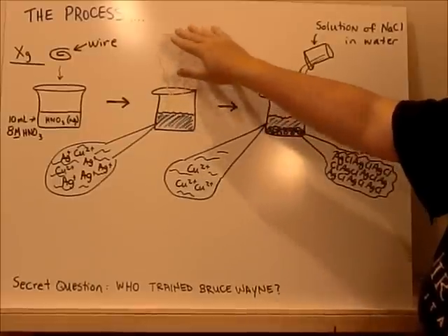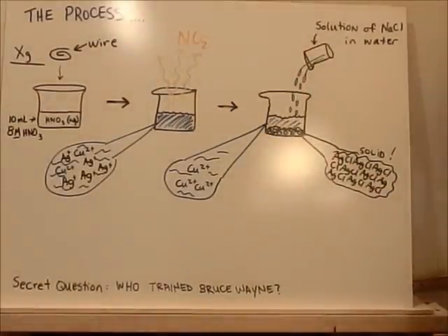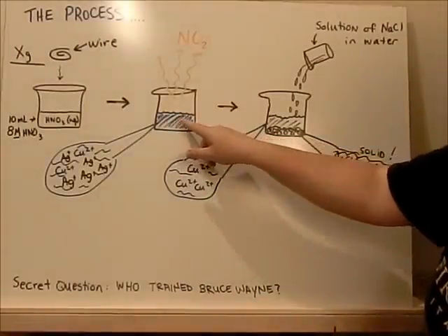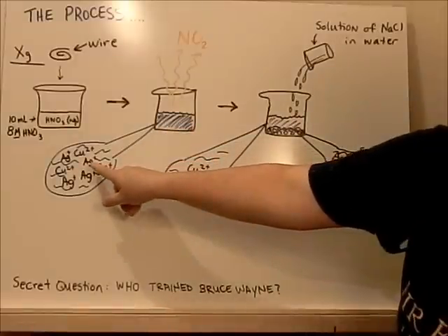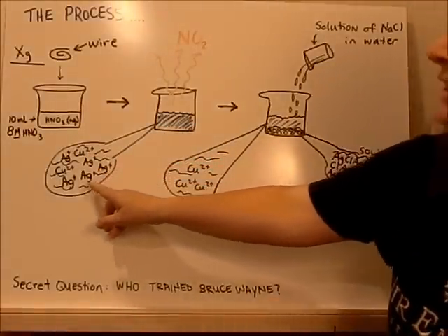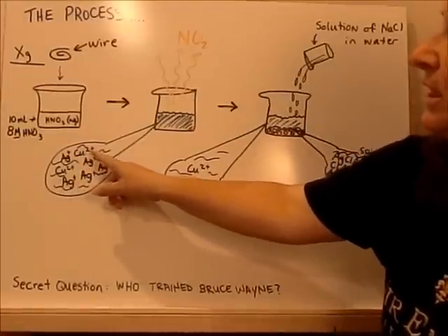You'll see a nasty gas comes off that's a mixture of NO2 that turns into N2O4. And if we could take a sneak peek inside the solution here, we would see a mixture of silver ions with copper ions dissolved. And notice you've completely separated the atoms in the wire.